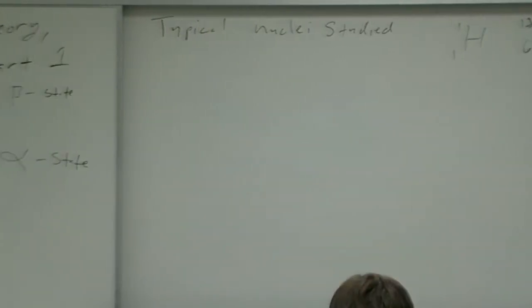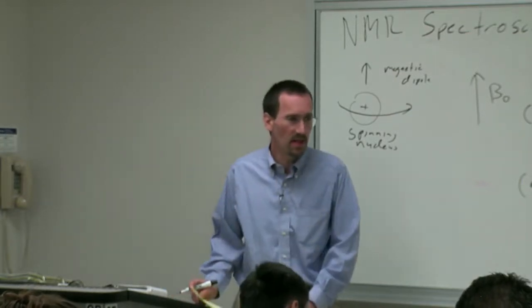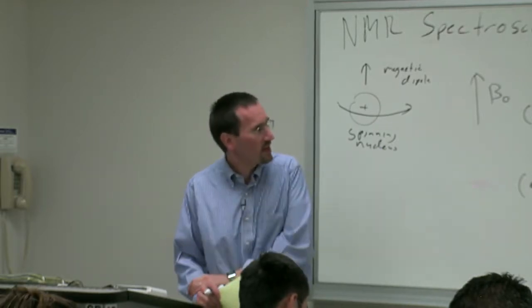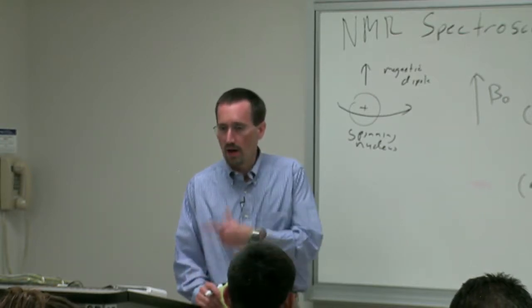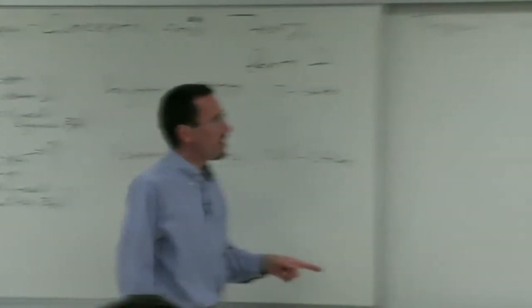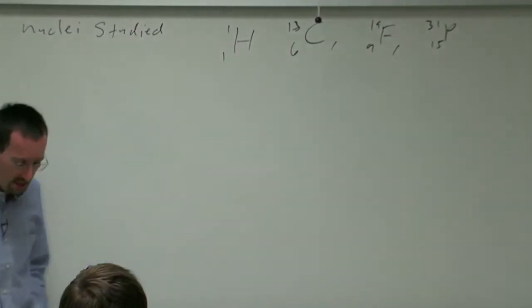They're easy to study. What do these nuclei have in common? 1/2. They have a 1/2, indeed. And forgetting their spin state, what property on the blackboard do they have in common? Odd numbers of protons and neutrons, or more specifically, we can group them that their mass number is odd, specifically that the sum of their protons and neutrons is odd.